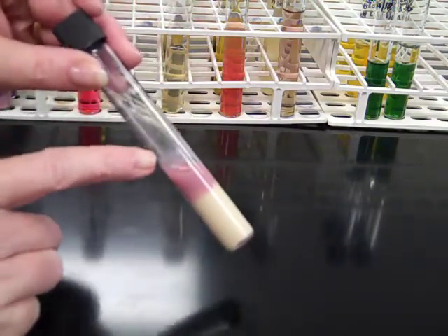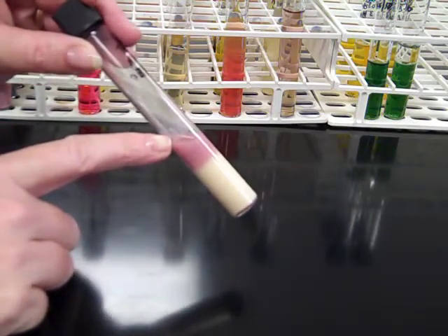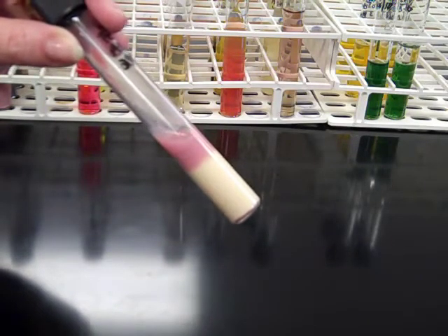If we tilt the surface of the tube, we're looking for a watery component where it's completely clear. If we have a watery component, that's an indication that the organism has completely digested the protein casein.